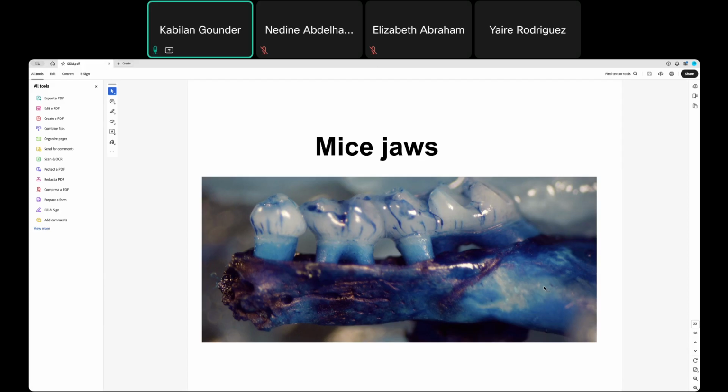Now we give some examples of what features you can see through the scanning electron microscope that you cannot in a light microscope, and whether it requires scanning electron microscope or whether stereo microscope images are enough.